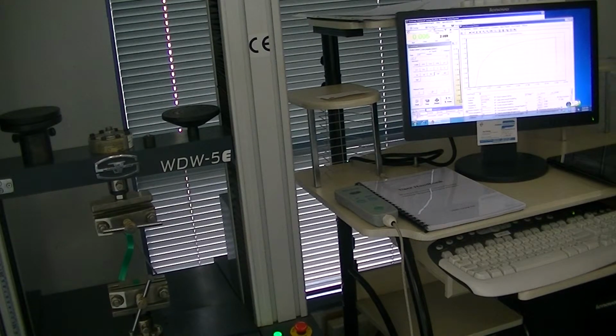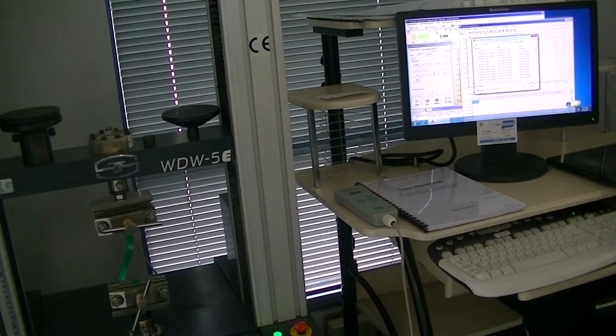We go on to slide number 12 now. Click file operation, like so. Then click open multi-curve data file. Open multi-curve data file. Then we go on to slide number 13.